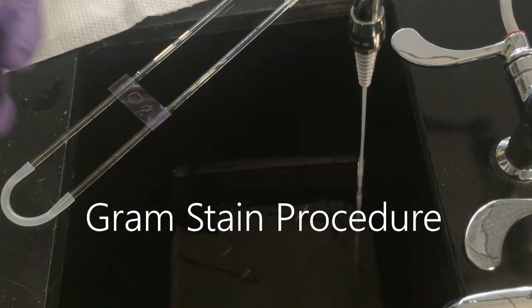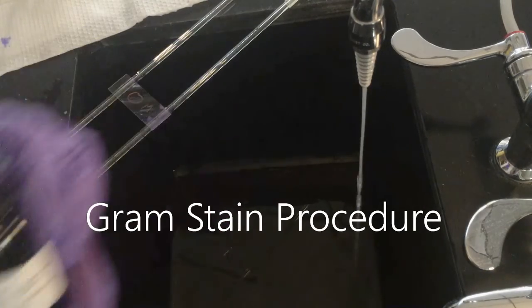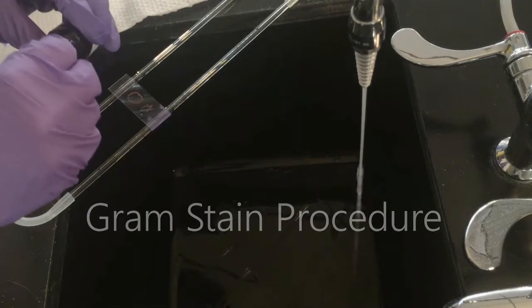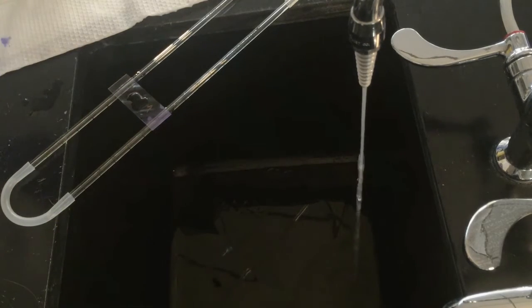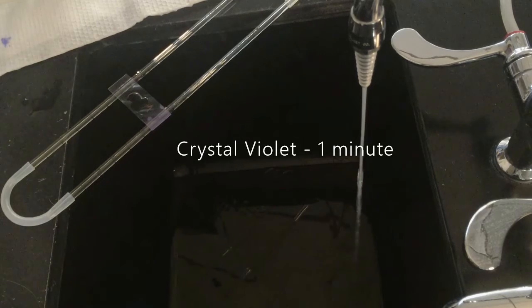The first step is adding the crystal violet. I add the crystal violet to the slide, put it on top of the bacteria, and let it sit there for one minute.